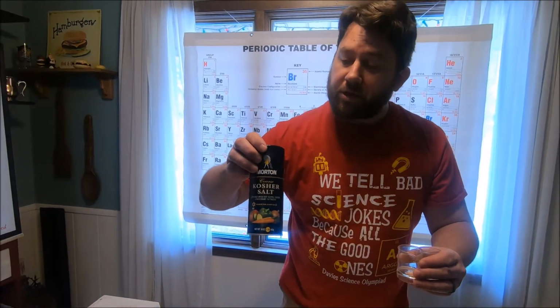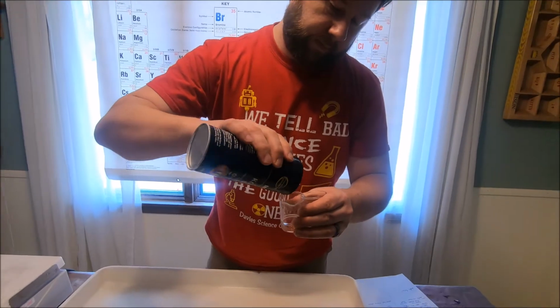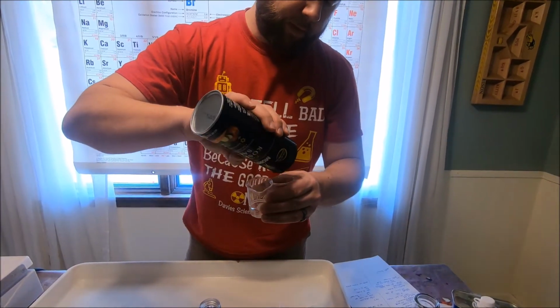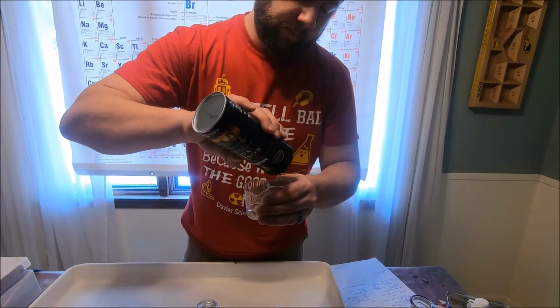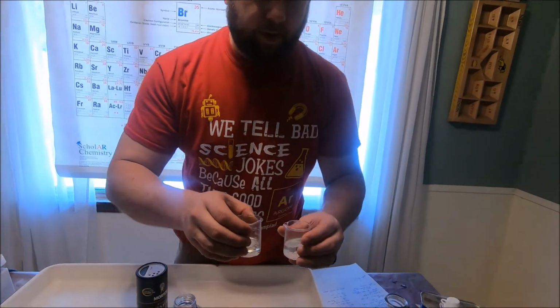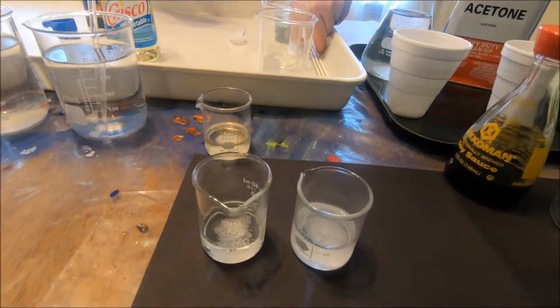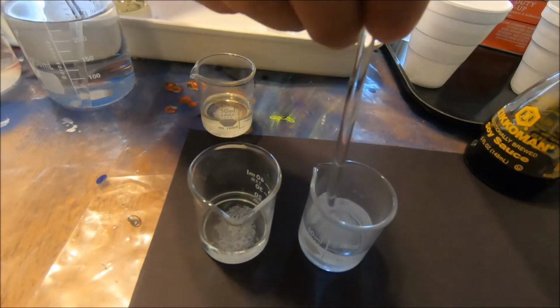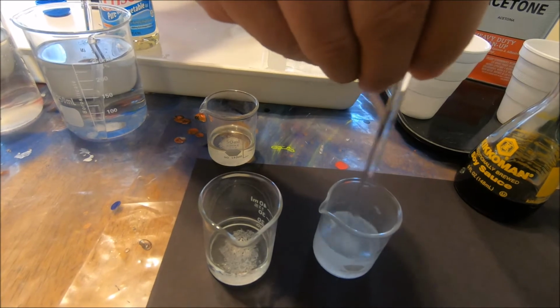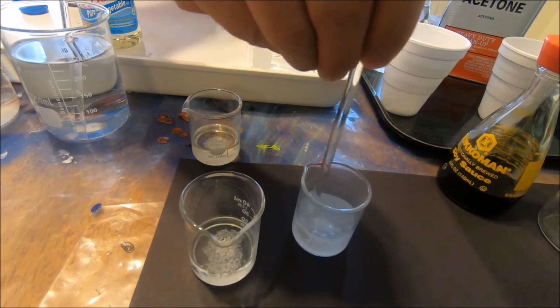What we're going to do with the salt is take some salt and put it into the oil, and we're going to put some into the water. Now as we let them sit here, one of the things we're going to notice is that as we let them dissolve, the salt will eventually, I put a lot in there, dissolve over time.